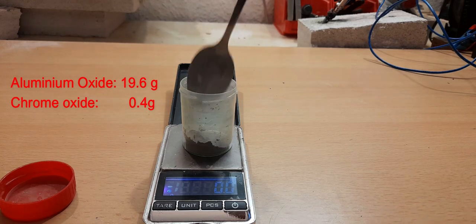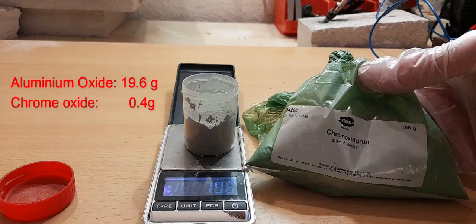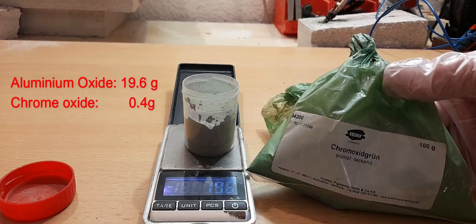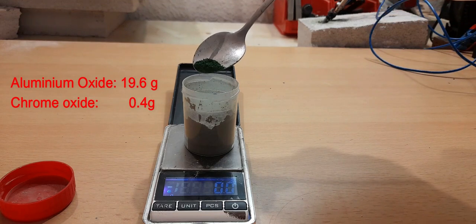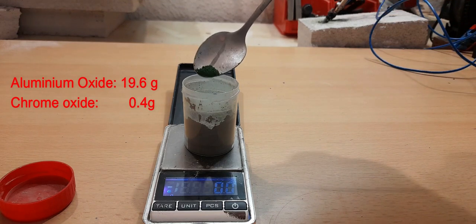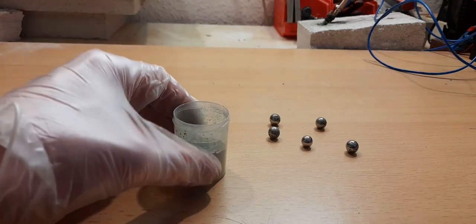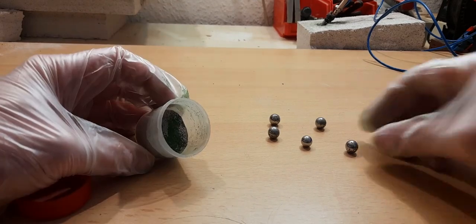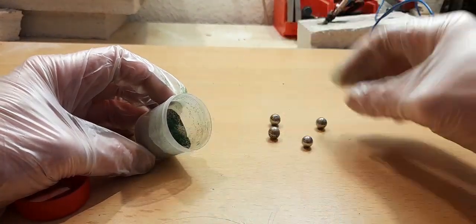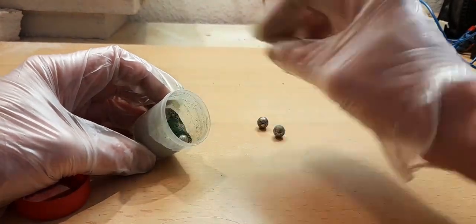We measure 19.6 grams of aluminum oxide with 0.4 grams of chrome oxide. Both oxides should be a fine powder and mixed well together. Mixing by hand is possible but a ball mill will give a better result. We carefully place some ball bearings in the oxide mixture, then close the container and tape it to a cordless drill.